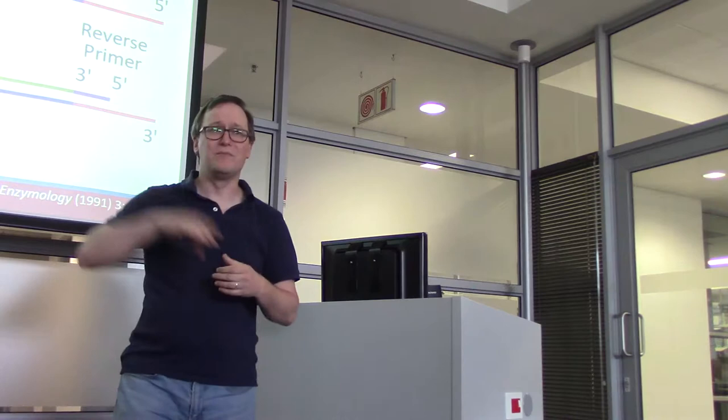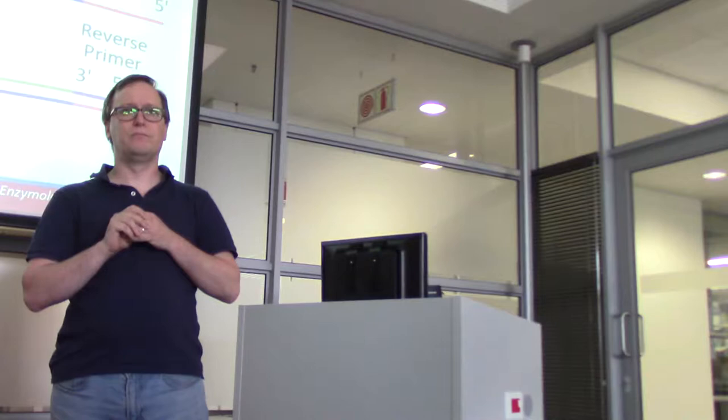So how long a sequence can you produce with old-school Sanger-style sequencers? Does anyone know? Okay, an old-school Sanger sequencer, like the ones that actually got the Human Genome Project completed, could do about 384 different sequences all at the same time. And each of those sequence reads would be 500 or 600 nucleotides long.